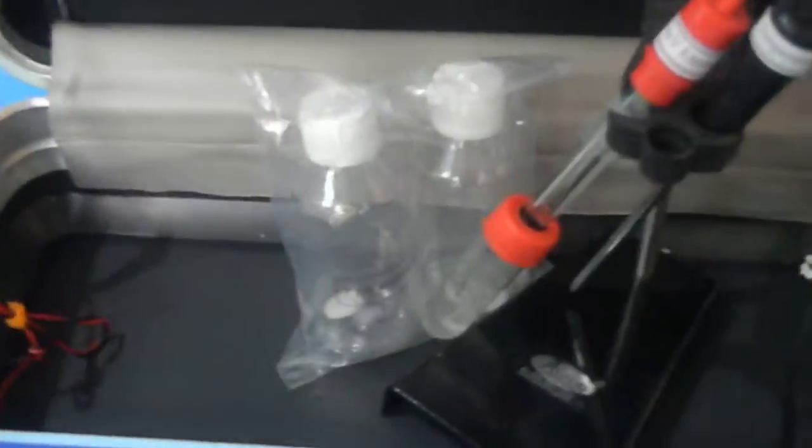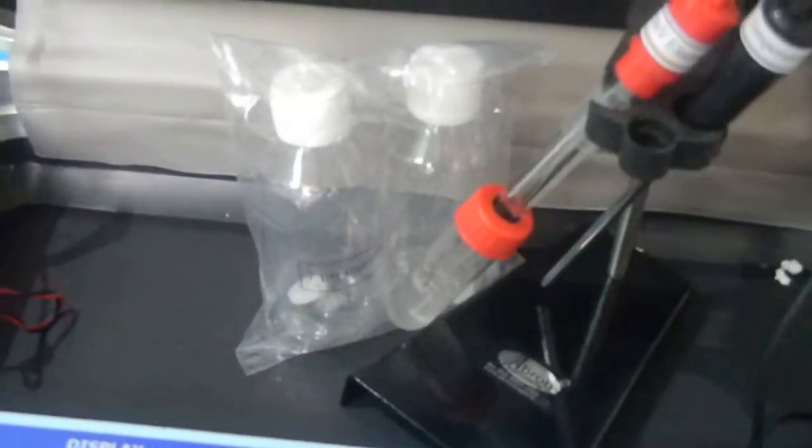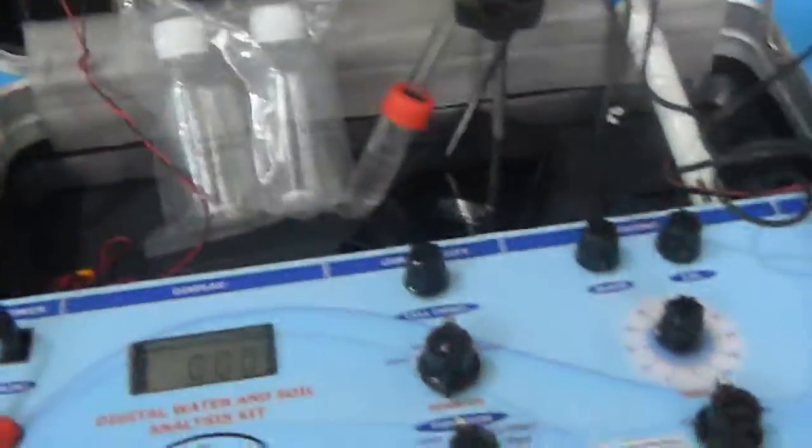And there are two bottles provided for making standard pH 7 and pH 4 tablets into 100 ml. You can connect the battery on the back side. There is a connection of the battery there. Then all these seven parameters can be calculated.